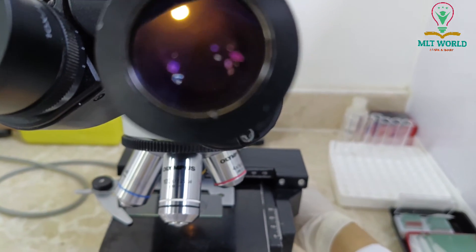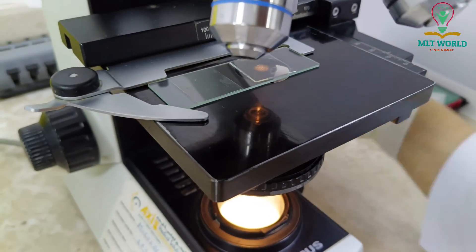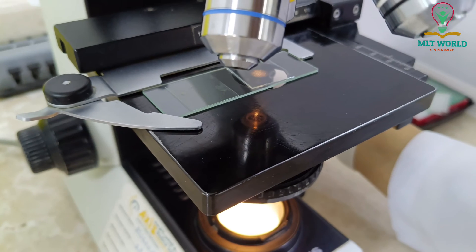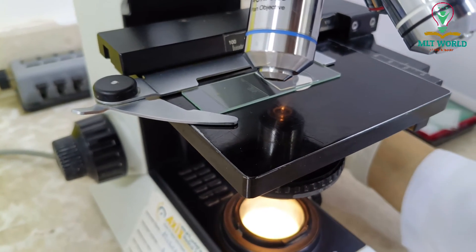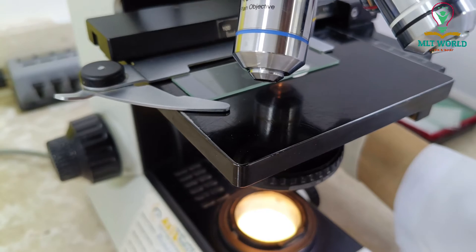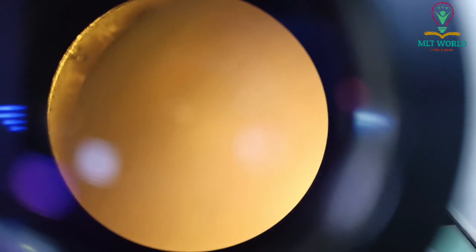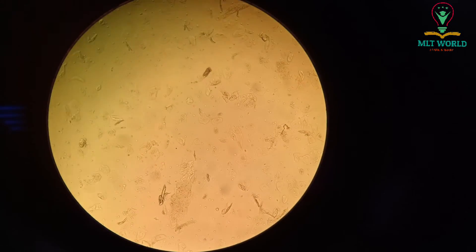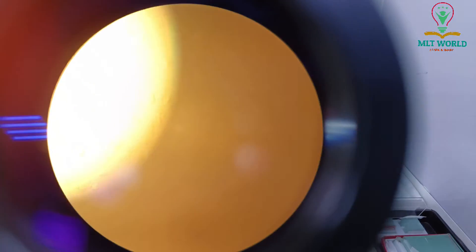First at 10x, I will move the coarse adjustment until I can see the field. Once I can see the field I will change the lens. Now you can see this field is clear — I can see epithelial cells, red cells, and mucus. But I need to read the exact amount, so now I will change the lens to 40x.